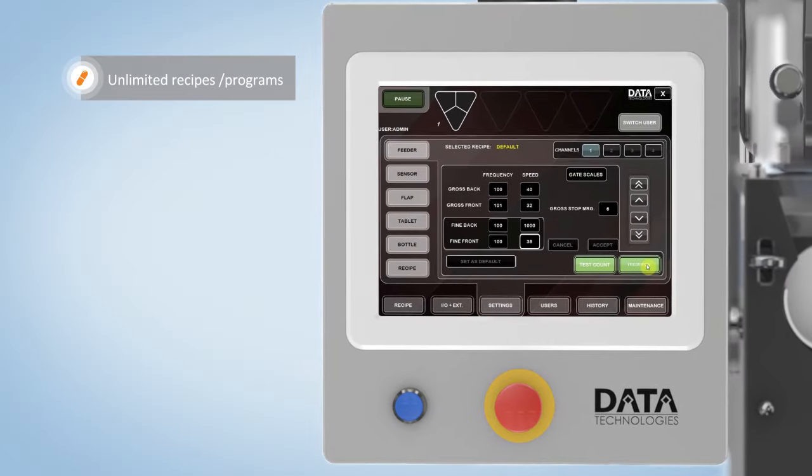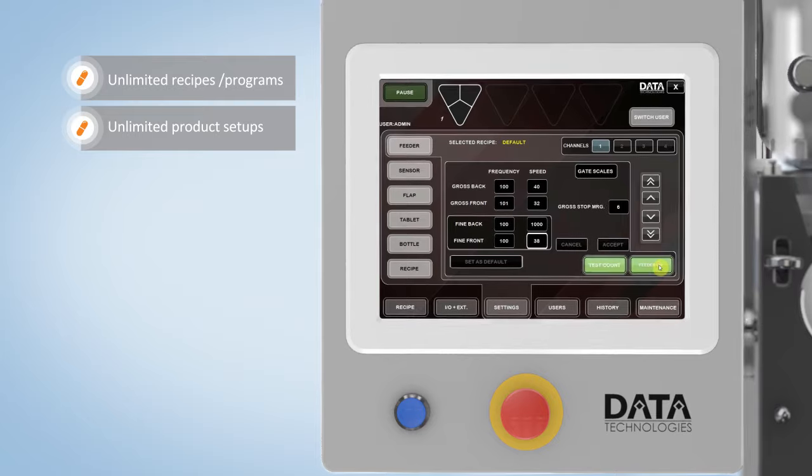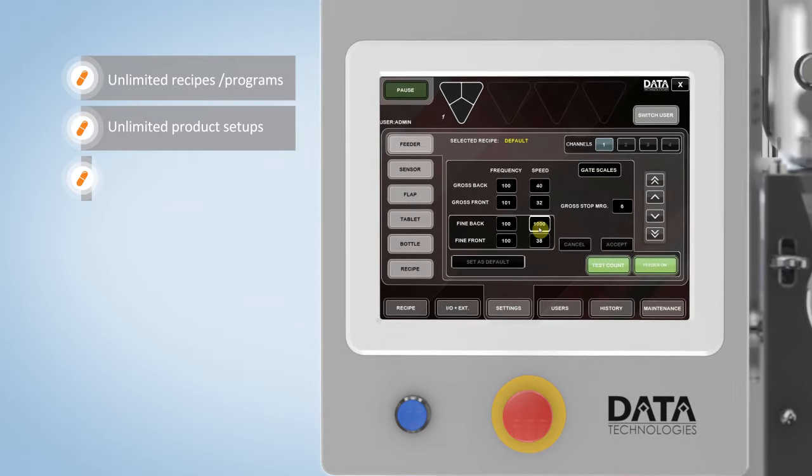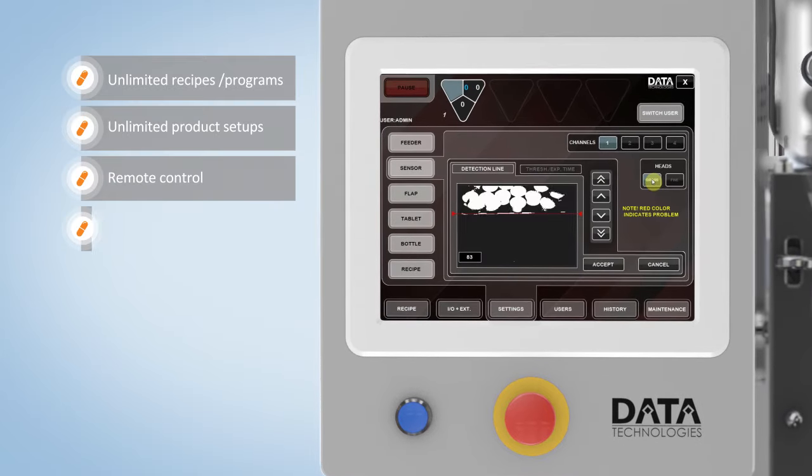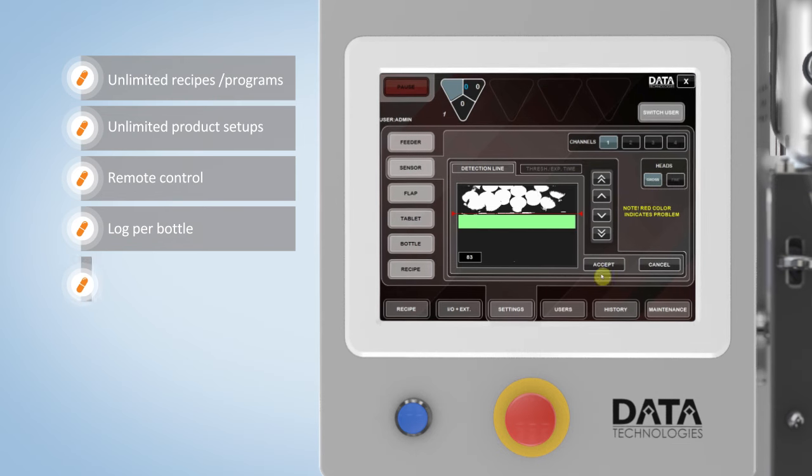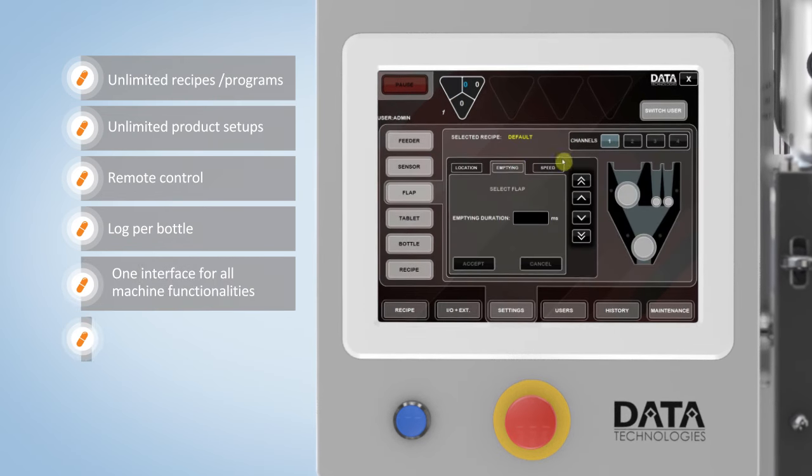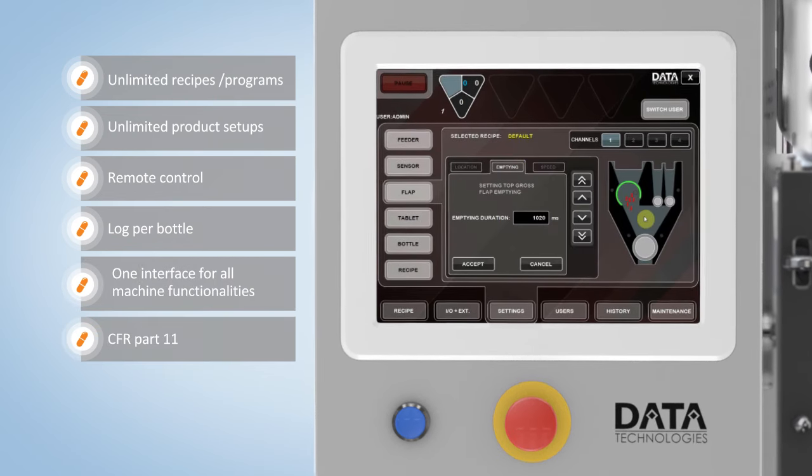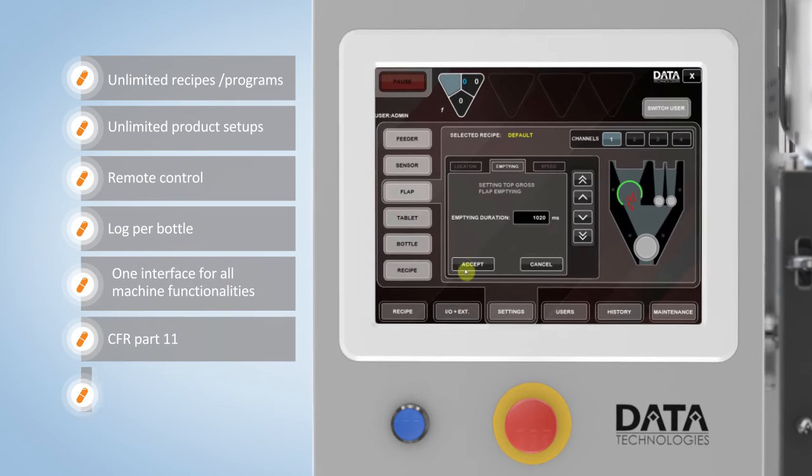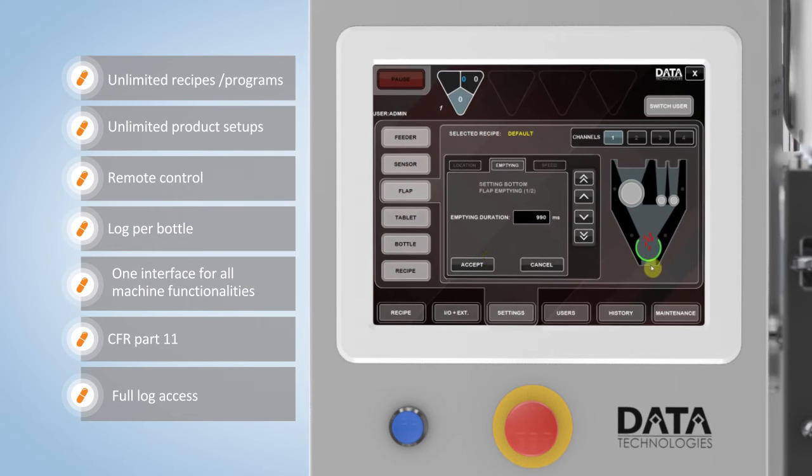The ICU is operated through a PC-based color touch panel. All internal and external machine functions are controlled through a single HMI, which fully complies with CFR Part 11.